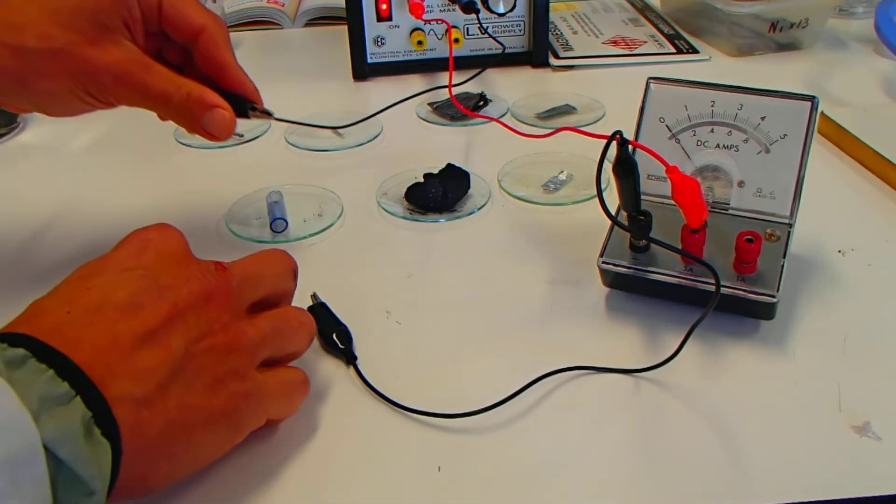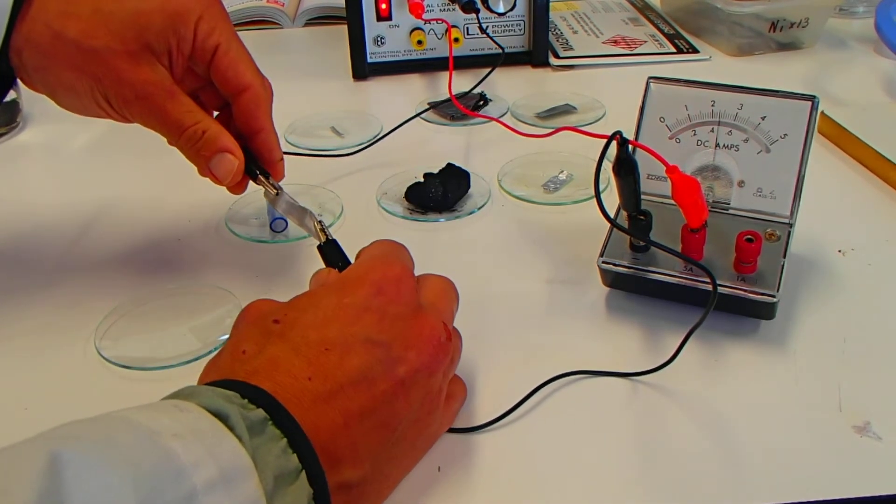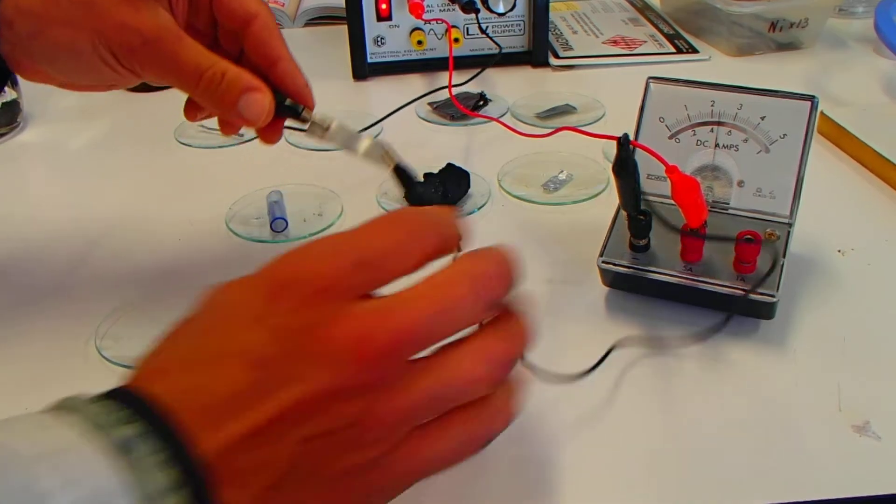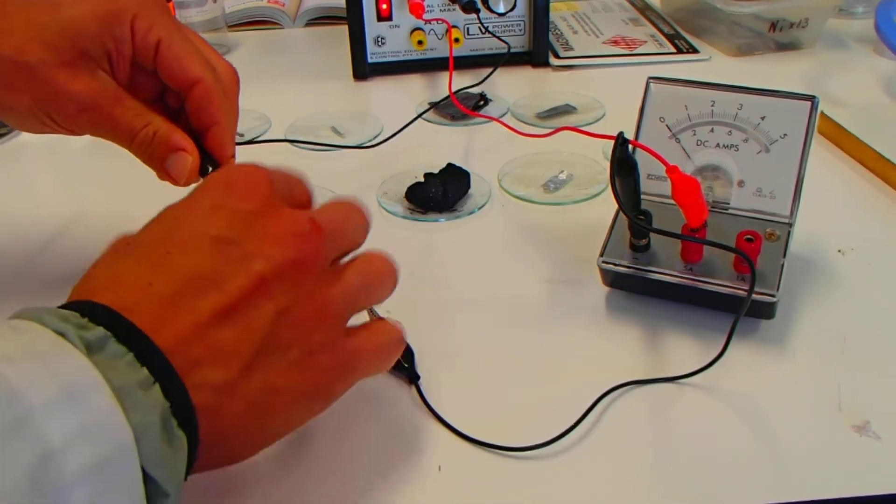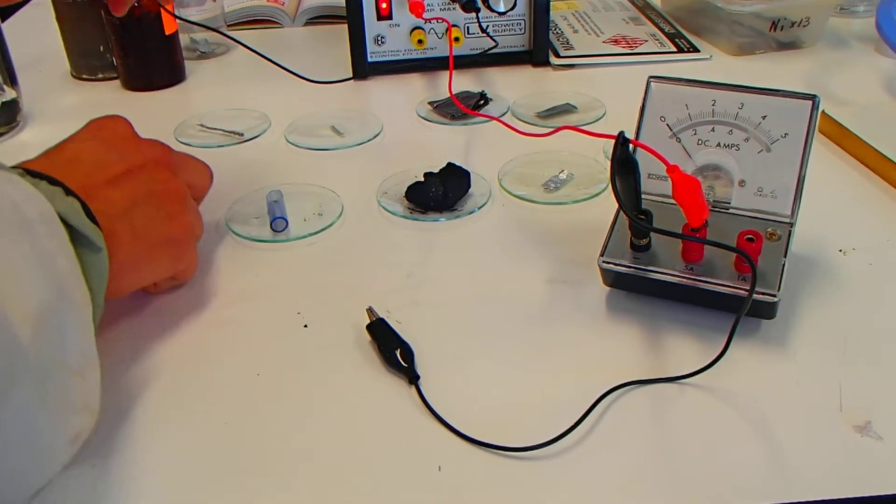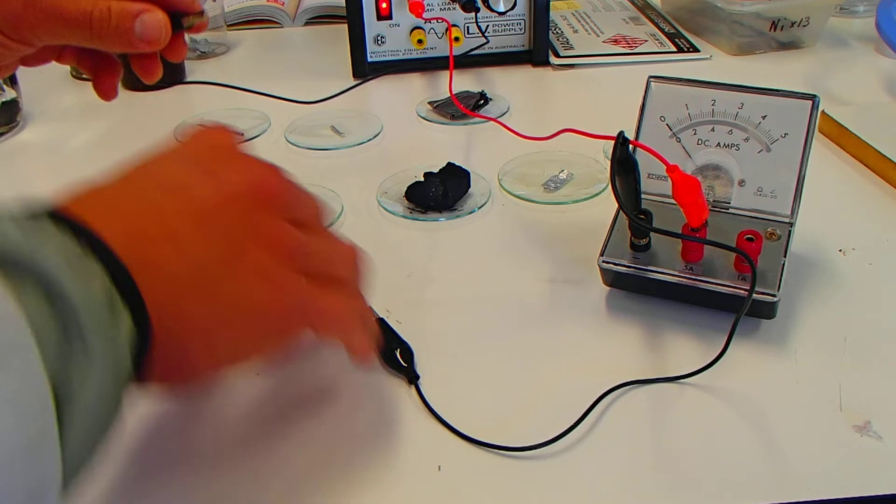Here we go for the tin sample. Put one on there. Put one on there. And yes, we have some current again for the tin. A bit of a relationship perhaps between the appearance and the malleability, that's the bendability, and its ability to carry current.